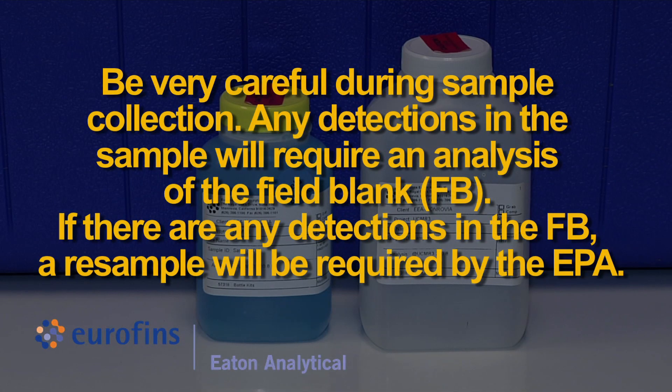Be very careful during sample collection. Any detections in the sample will require an analysis of the field blank. If there are any detections in the field blank, a resample will be required by the EPA.